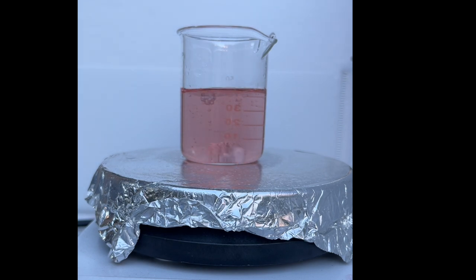In this system, the color change is a result of the oscillation of the concentration of manganese 2 and manganese 3 ions. In a future episode, we will delve deeper into the detailed mechanism of the BZ reaction. For now, let's briefly examine this reaction. Manganese 2 has a faint pink color, but considering its concentration, it appears colorless in this demonstration.